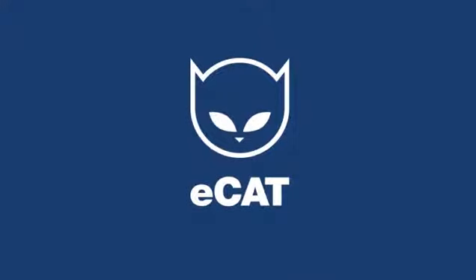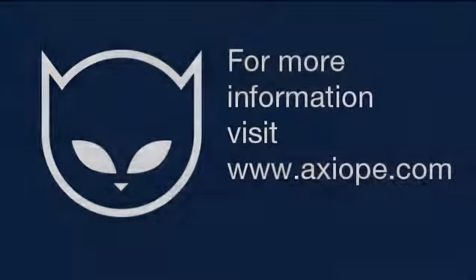So, with eCAT, you can organize your lab's research in a structured way, the way you and the members of your lab want. You and the other members of the lab can collaborate and communicate in eCAT anytime, anywhere. eCAT brings the lab and your research together in a way that's never been possible before.